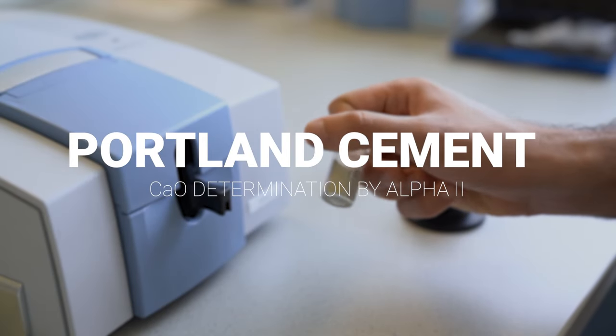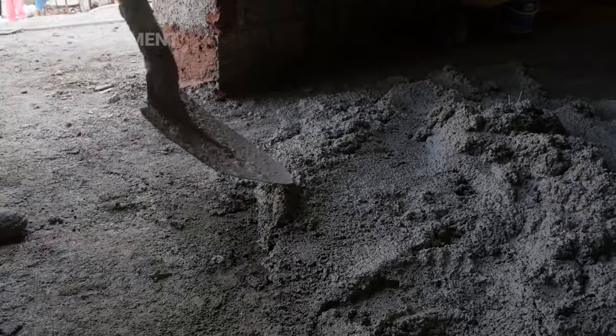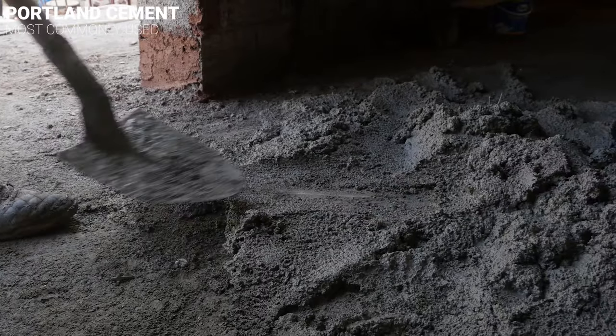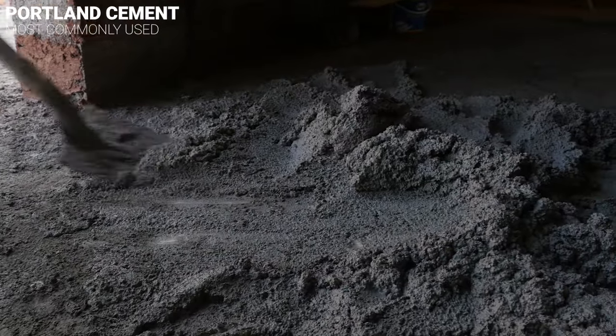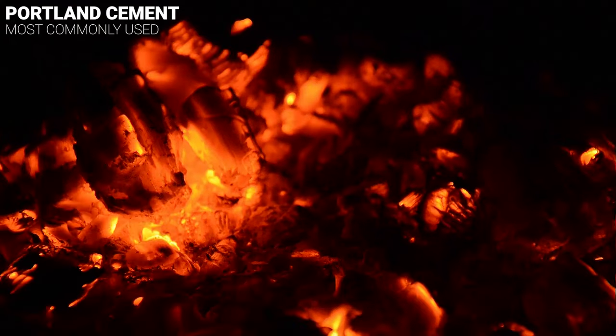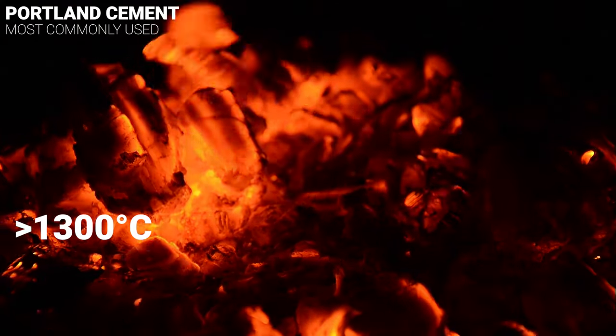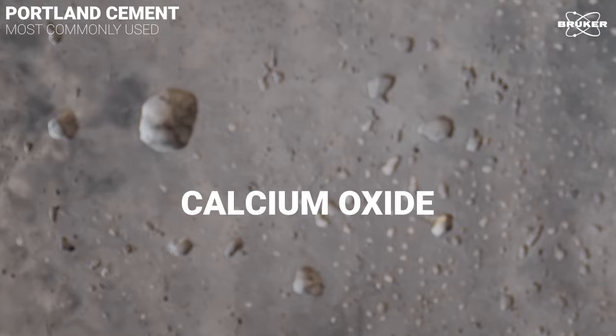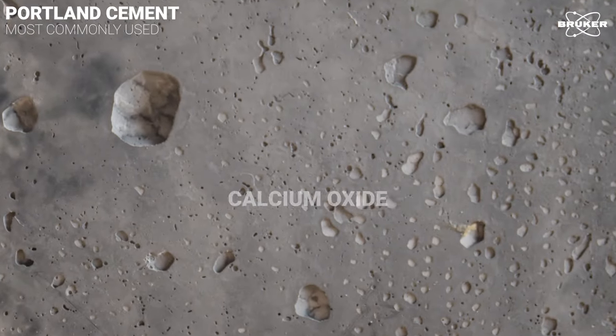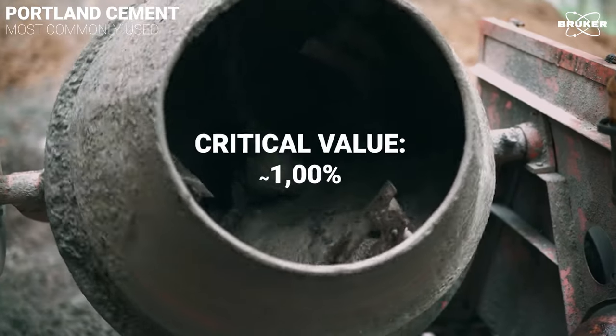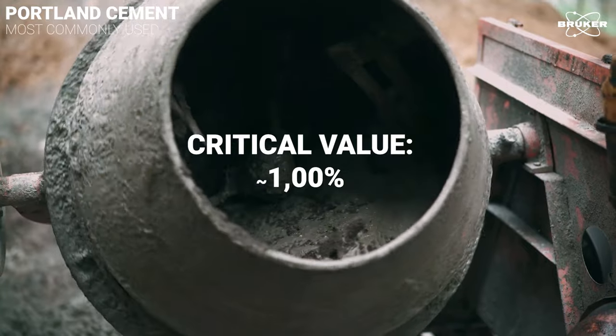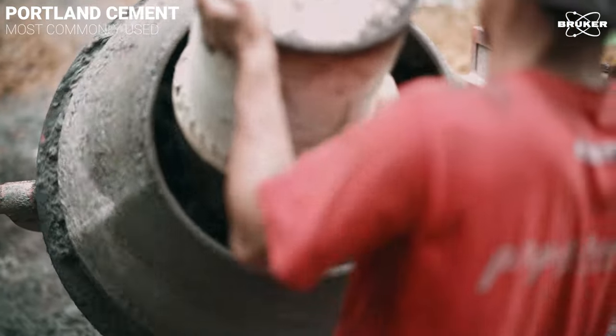Calcium Oxide Determination in Portland Cement. Portland cement is the most commonly used type of cement in the world. During its production at over 1,300 degrees Celsius, calcium oxide is formed as a byproduct. In the final product, Portland cement should ideally contain approximately 1% or less of free calcium oxide.